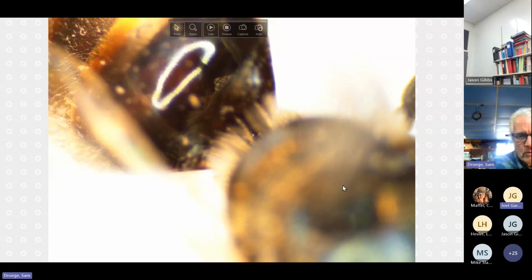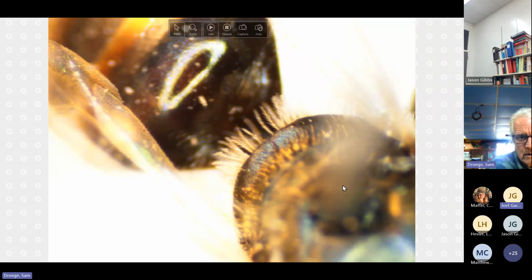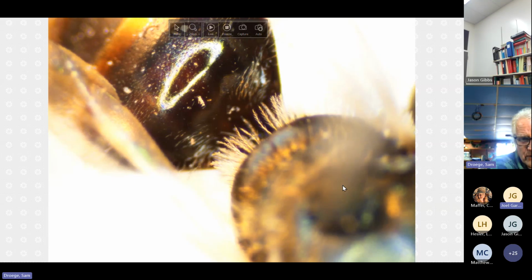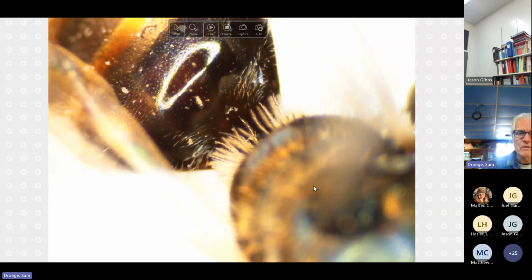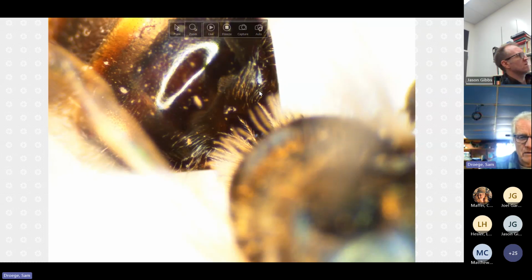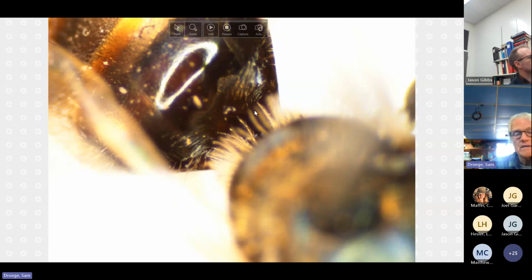Okay, so here we're looking at T1, and we're peering down the front face of it. Here's the rim of T1 joining T2. Fortunately, a lot of times the specimens droop their abdomens a bit, and you'll be able to peer in there. If you do them the traditional European way, you're not going to see that fan because it will be pressed up against the propodeum.